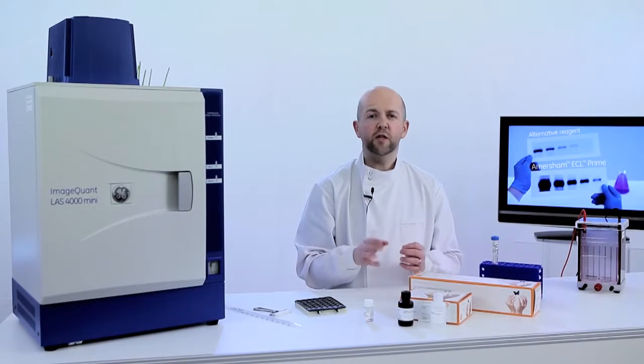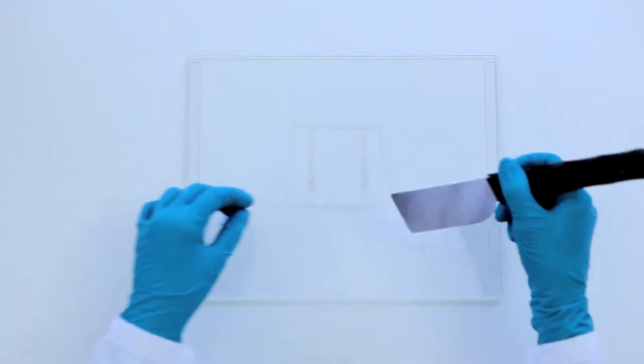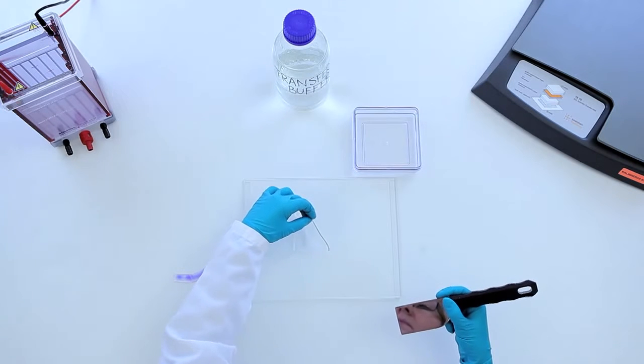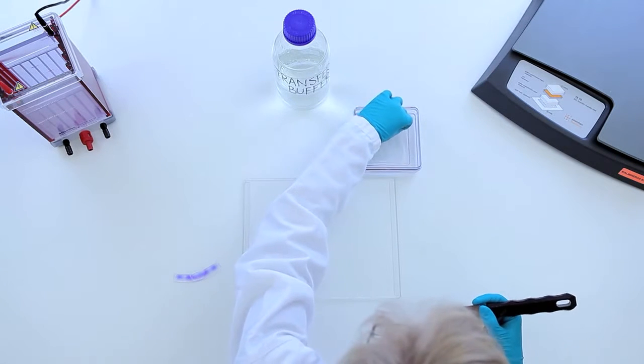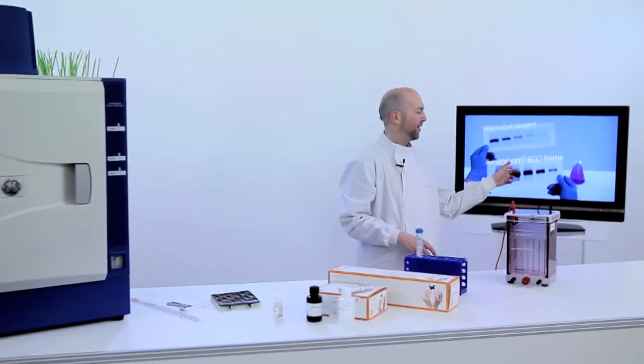After completing the electrophoresis of your sample, simply continue to use your own standard Western blotting protocol. There are 3 areas for you to consider before you start. It is important that the sample is of good quality and that the gel is loaded optimally. Select the electrophoresis and transfer conditions depending on protein size and characteristics. Prepare the gel for blotting by trimming excess gel. Equilibrate in transfer buffer for 10 minutes to maintain the shape of the gel. I will now take you quickly through a Western blotting procedure, beginning with building the sandwich and highlighting key issues. To see a demonstration of the procedure in detail, click on the TV screen.